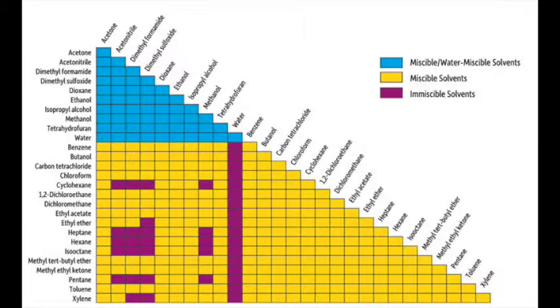There's a few others. But if you're trying to use different solvents that you're unfamiliar with, use a table like this to make sure that you are using two immiscible solvents if you want to form two layers and do a liquid-liquid extraction.